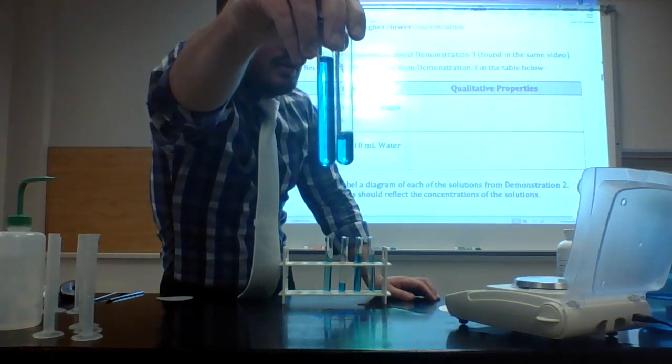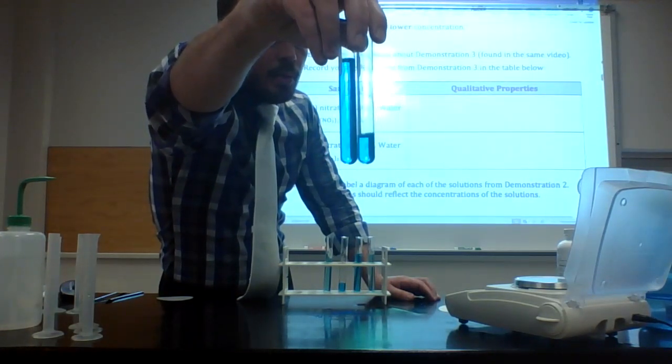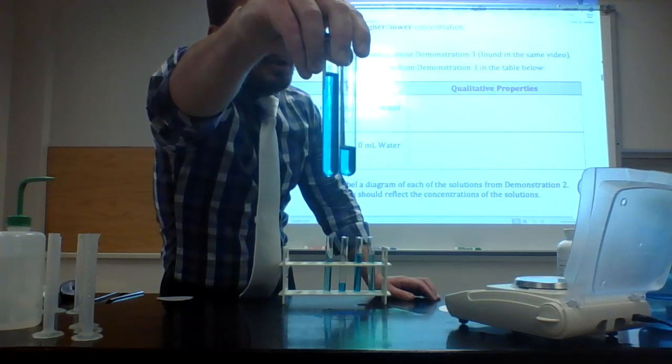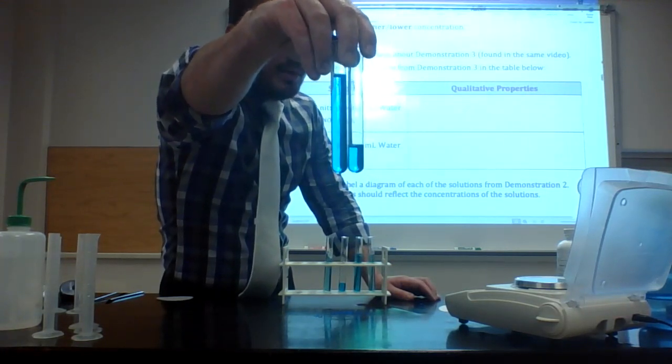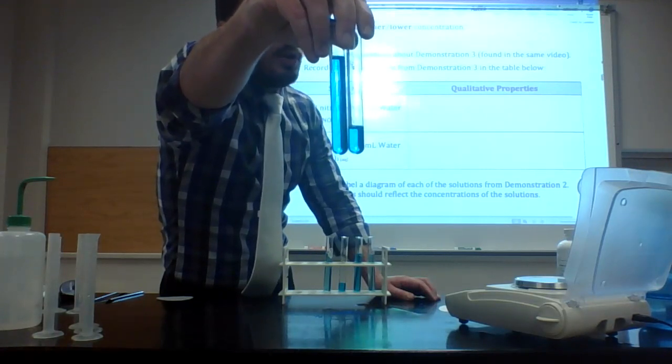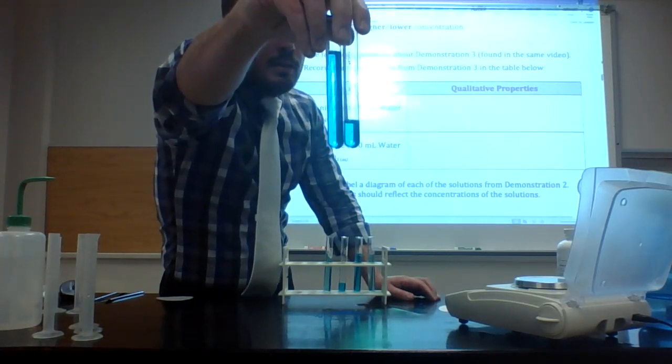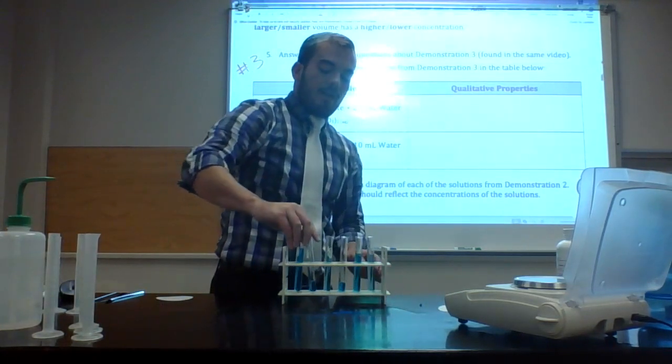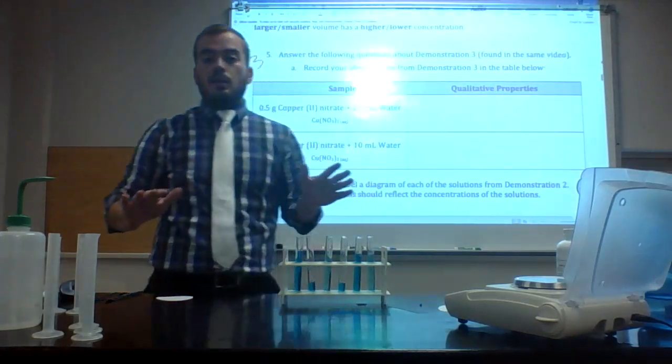But these are now the exact same shade of blue. Neither is darker than the other, they're pretty much identical. The solution on your right, the one with the smaller volume, is 0.5 grams and 2.5 milliliters. Solution on the left with the larger volume is 2 grams in 10 milliliters, and they have the same exact color.